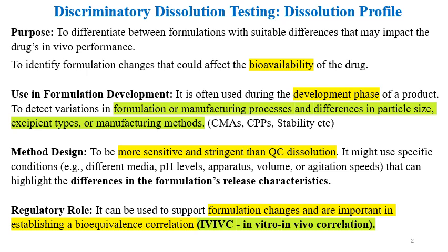The purpose of discriminatory dissolution testing is to differentiate or distinguish between the formulations with suitable differences or meaningful changes done to the formulation composition, manufacturing procedure that may have impact on the drug's in vivo performance or bioequivalence and bioavailability.